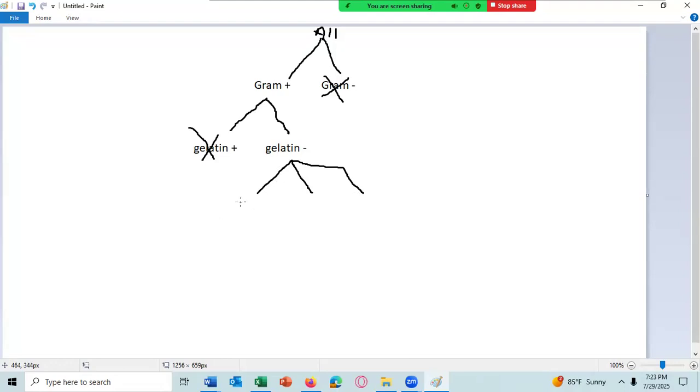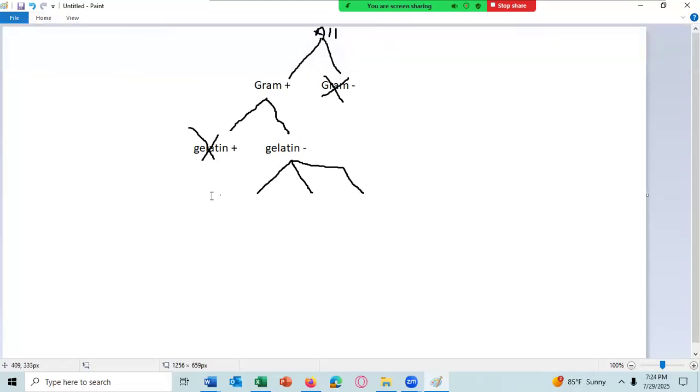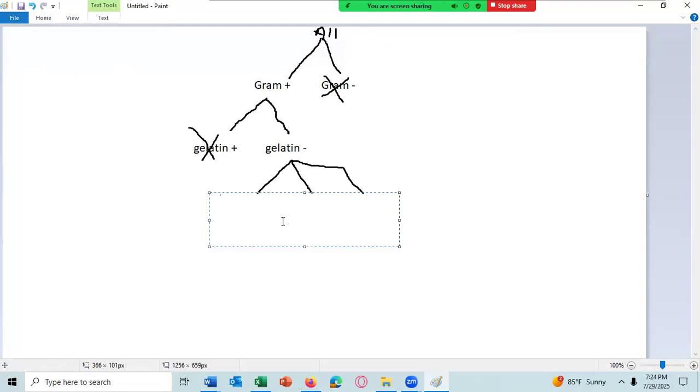We have lactose AG, lactose A, oops, let me just move that down a little, and then lactose negative.